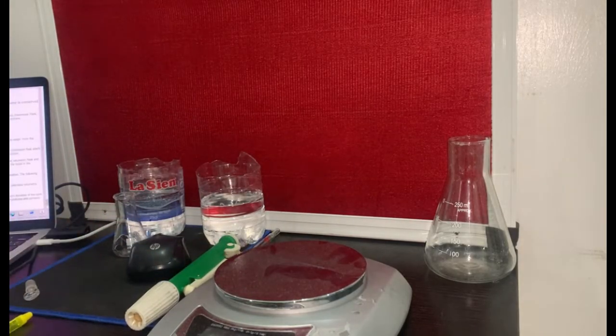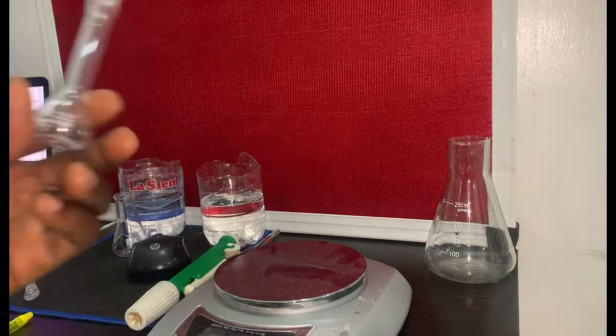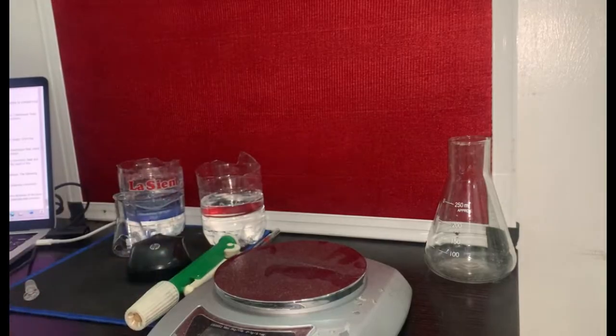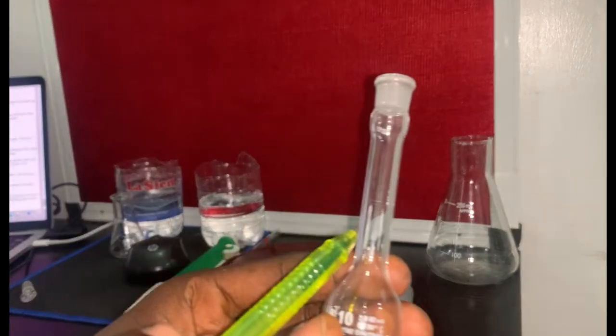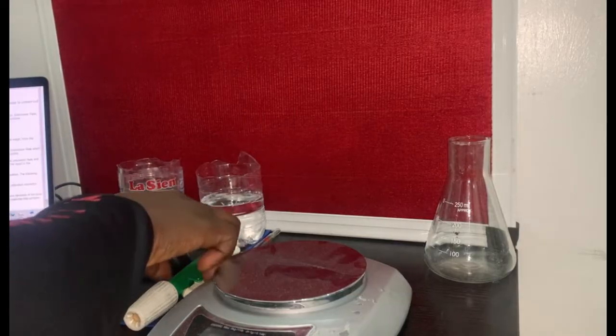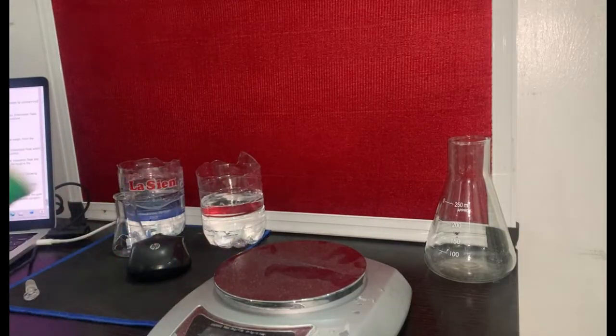Now they said we fill this flask with water to the point where it is marked. You see the point where it is marked here. I want you to see the point where it is marked, and then weigh it again. Now I'll use my pipette to take the volume of water.